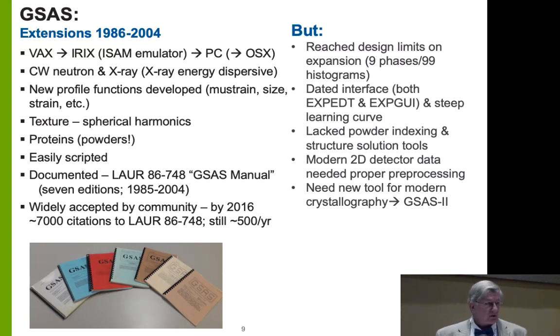And also got the crazy idea of saying, well, what would happen if you took a powder pattern of a protein? And the shock was that the lines were sharp, sharper than the standards produced by NIST. And so I said, I had to do something with that data. So I put into the Rietveld refinement code the capability of analyzing protein structures and managed to refine a couple, solve one, and also demonstrated other aspects of protein crystallography for powder diffraction.